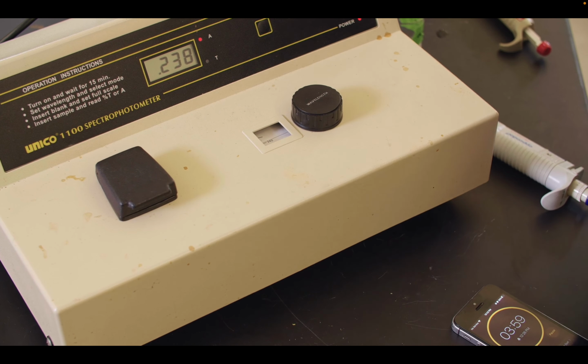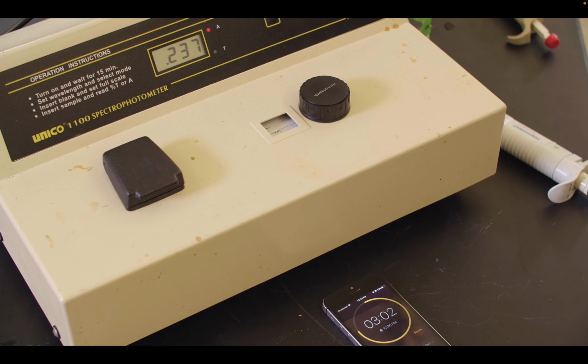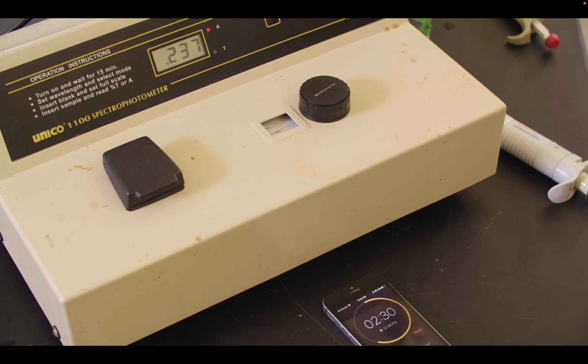And again, our 4-minute timer. At the beginning, 0.0, the absorbance is 0.238. At 30 seconds, it's also 0.238. At 1 minute, we'll call it 0.237. At a minute and a half, it's also 0.237. At 2 minutes, it is 0.236. And at 2.5 minutes, it's also 0.236.